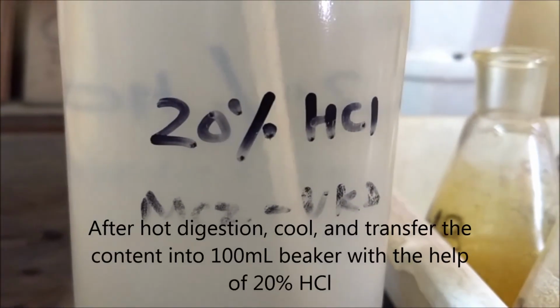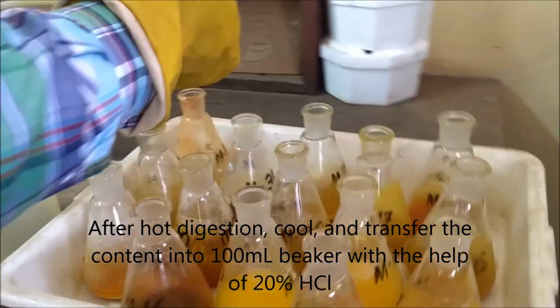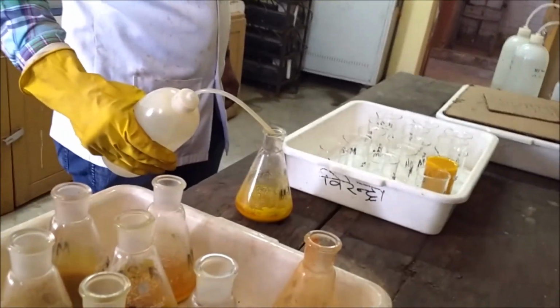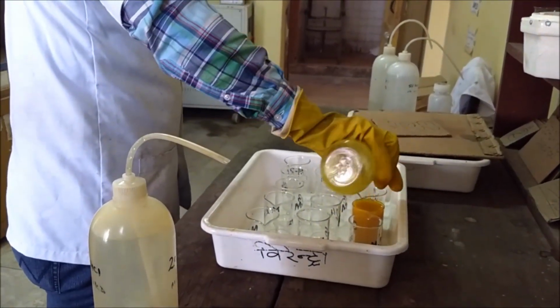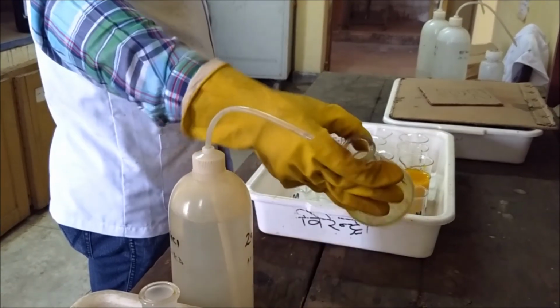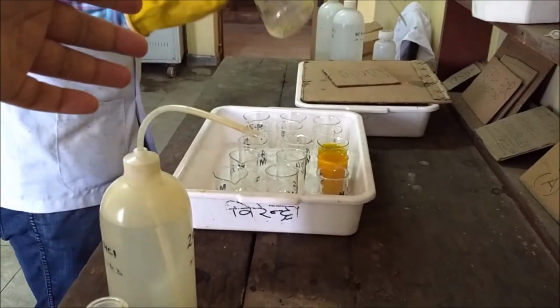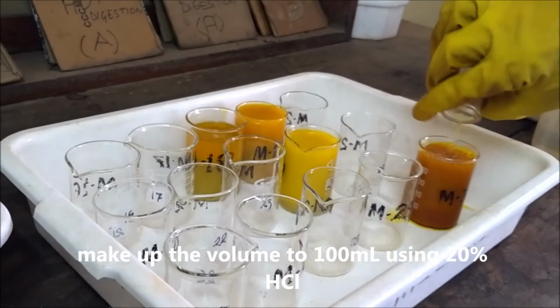For transferring these samples, we will use 20% HCl. 20% HCl is used to obtain maximum extraction of gold. While transferring the samples, make sure all content goes to the 100 ml beaker. After transferring, make up the volume to 100 ml using 20% HCl.